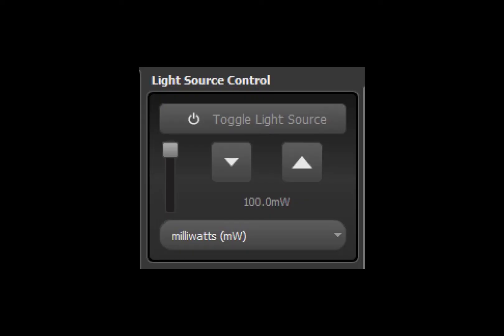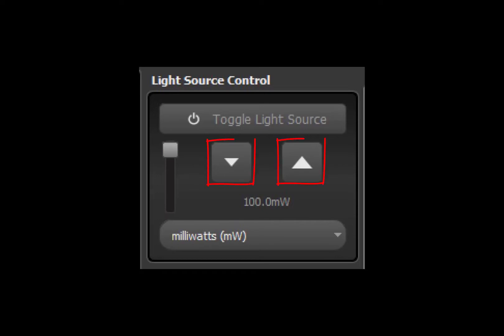However, the function looks like this, and allows the user to manually turn the light source on and off by clicking the toggle light source button shown by the red circle. The user is also able to control the output wattage of the laser as a percentage of the maximum power using either the vertical slider where moving upwards approaches maximum power, using the up and down arrows, like so, or simply clicking in the editable numeric field below the arrows.